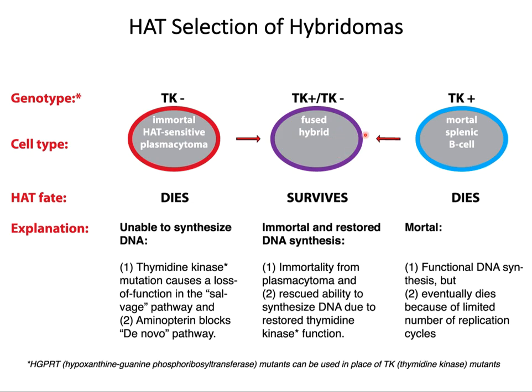These hybridoma cells will produce the monoclonal antibodies that will be secreted in the cell culture medium and can be purified. Once established, each hybridoma cell clone will produce an antibody against a single epitope, and hence they are called the monoclonal antibodies.